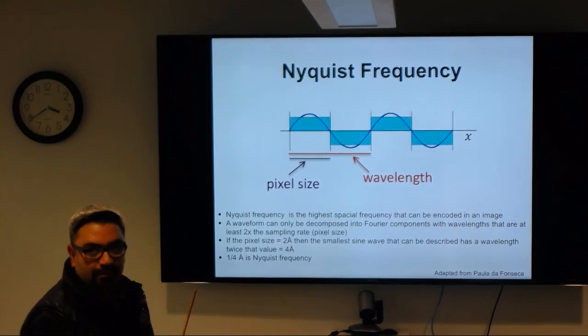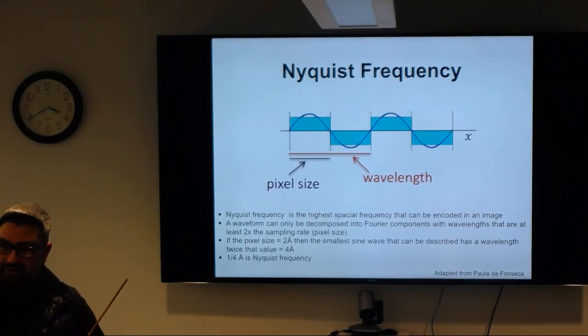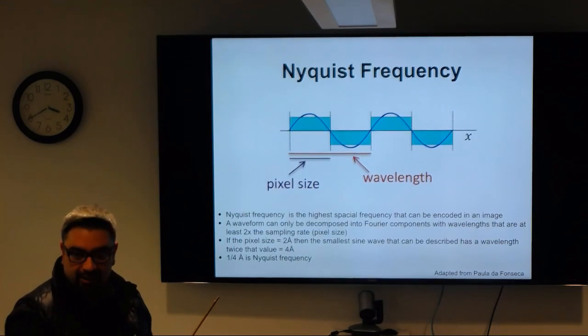So actually, crystallographers, what's your Nyquist limit? Your wavelength is the highest resolution X-ray crystallography structure possible, theoretically. So to try to answer that question in Fourier space, we could think about spots, right? We could think about the reflections, and when we look at those reflections, we look at the spot that goes out to the furthest edge, right? And so that could be where our highest resolution possible could be.